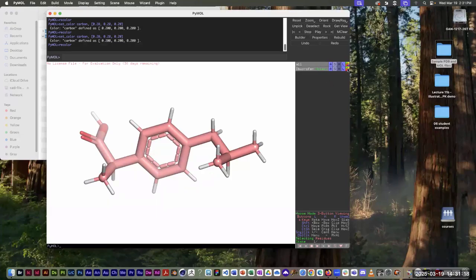There might be a way to change that. The little menu to the far right of the name of the molecule, the one with the little rainbow, the C is for color. If I change that to color by element and choose this first option, it might work if we're lucky. And of course, that doesn't work either.